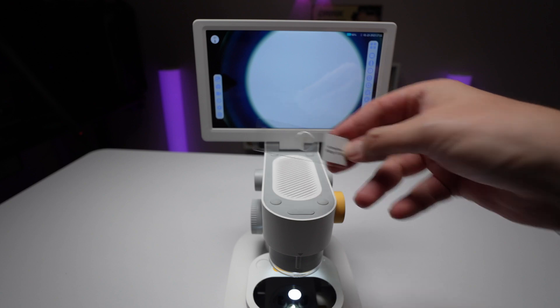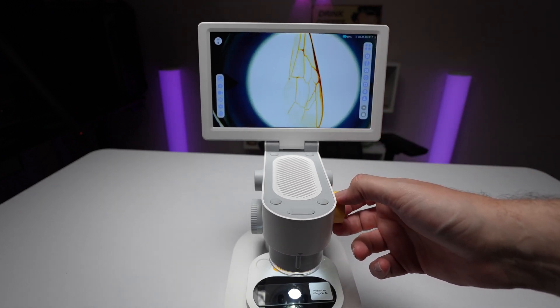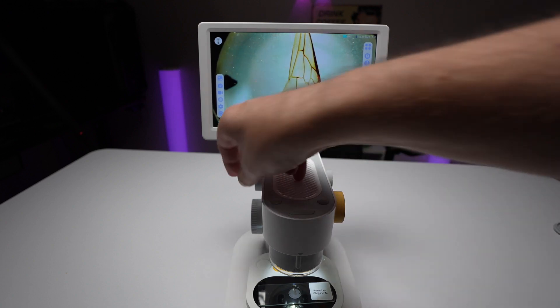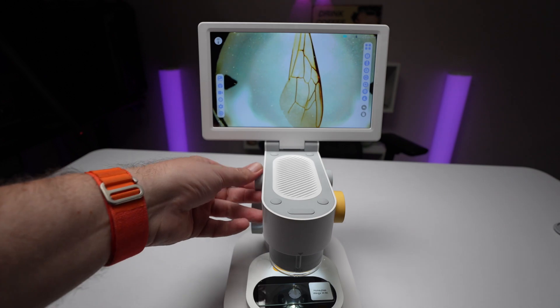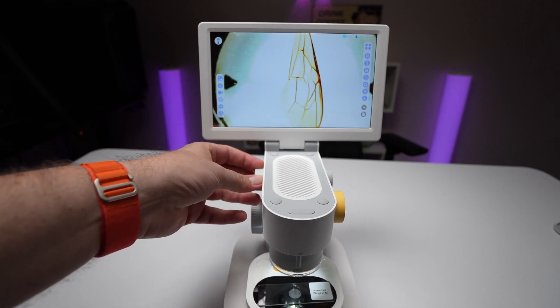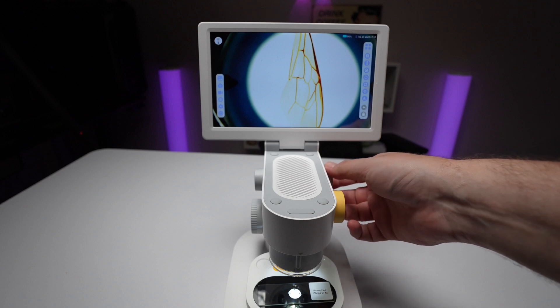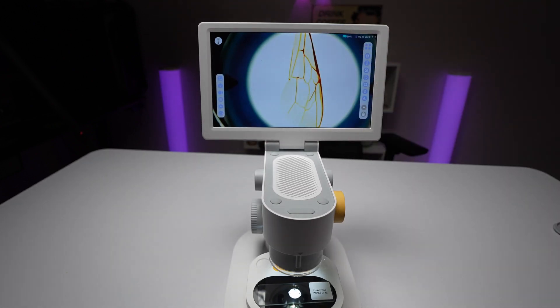So let's go ahead and put a couple slides in. I got a honeybee wing here. You can use the focus to make it a little easier to see, and as you can see that is a pretty nice picture. We're on the 100 times right now and I do have that light turned up. The light is facing downward and the knob over here will adjust and turn that on and off. So now with no light you can still see some stuff, but turning that light back on makes it a little easier to see. You can also turn that other light on and adjust — you may not need as much light depending on what you're trying to look at. If you want to take a picture you can just hit that picture button and it's going to say picture saved. Now you'll be able to load that onto a computer.